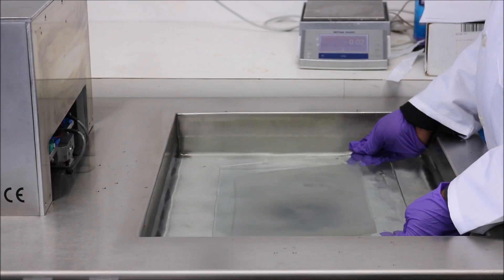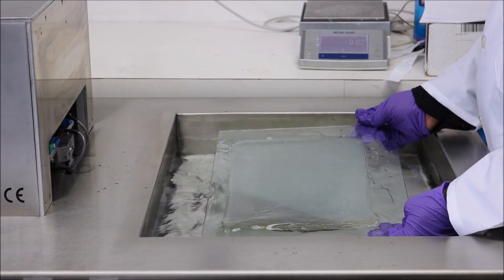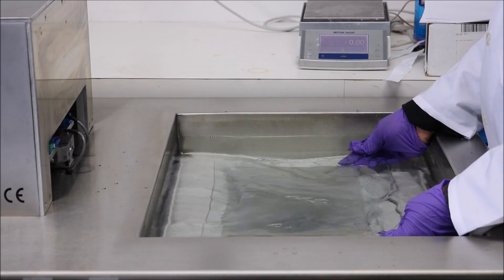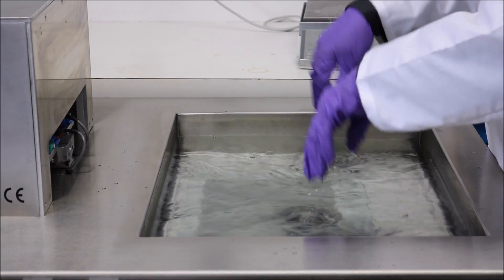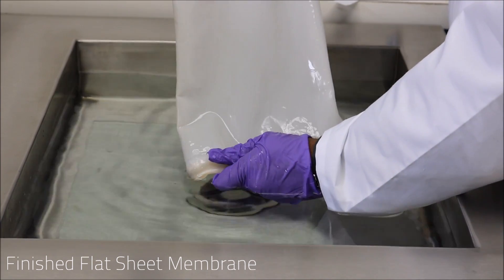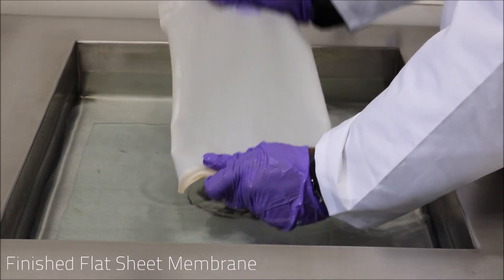Carefully submerge the plate into the coagulation tank to allow for solvent replacement and polymerization to occur. After allowing some time for the polymerization reaction, we now have our finished flat sheet membrane product.